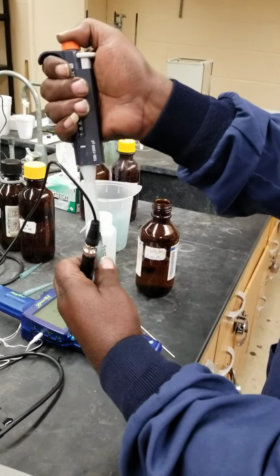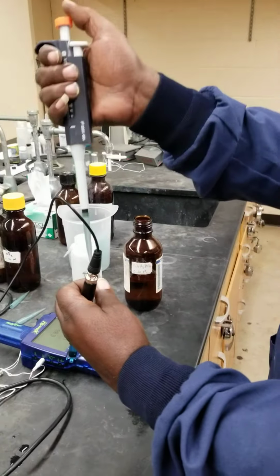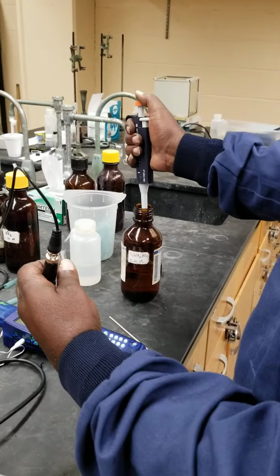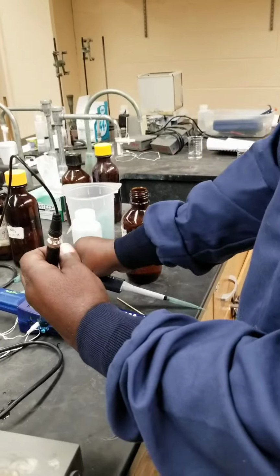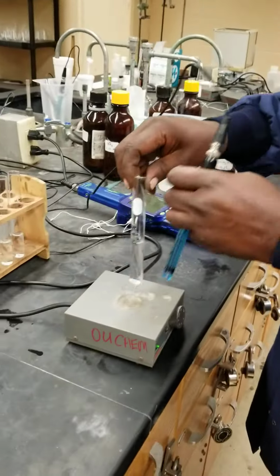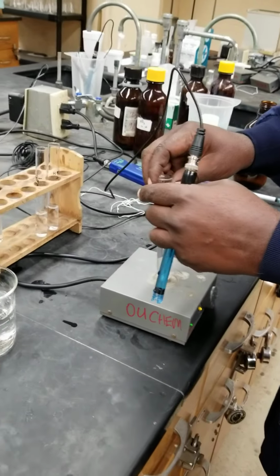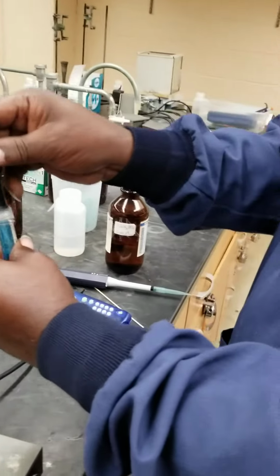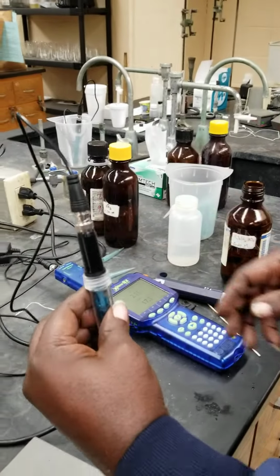One. Two. Three. Mix. Up and down to make sure everything is nicely mixed.